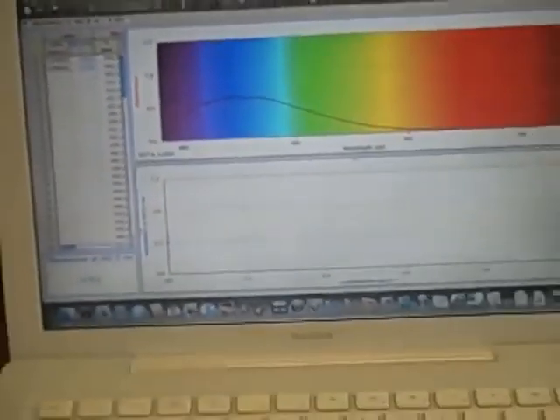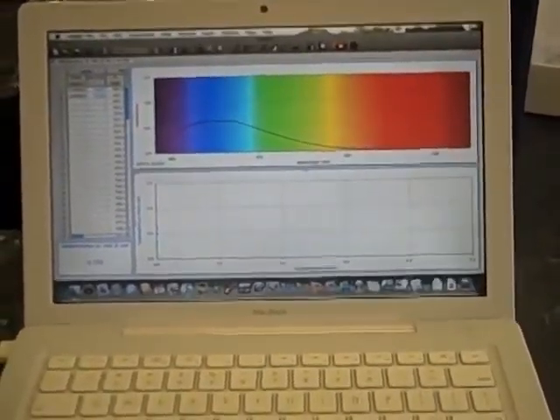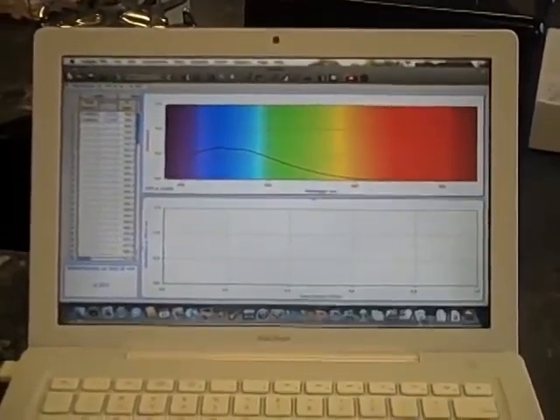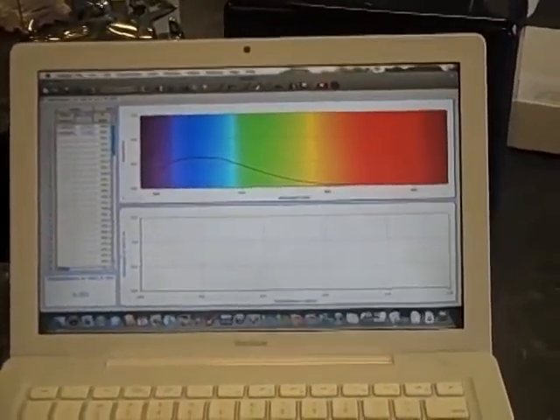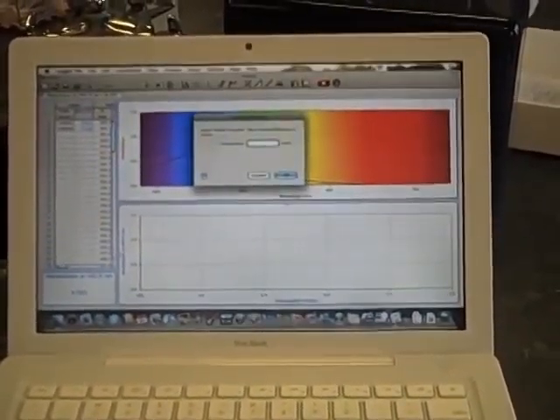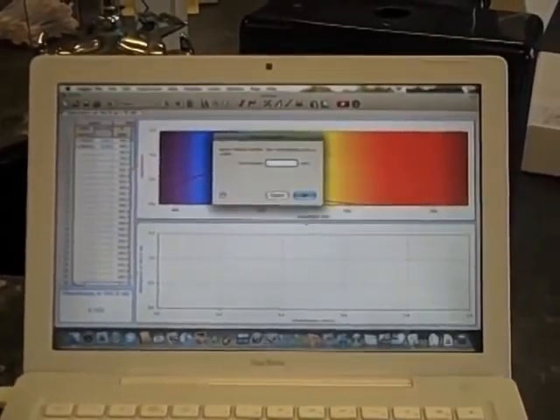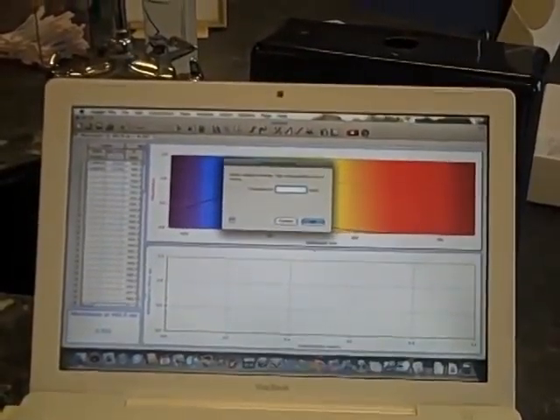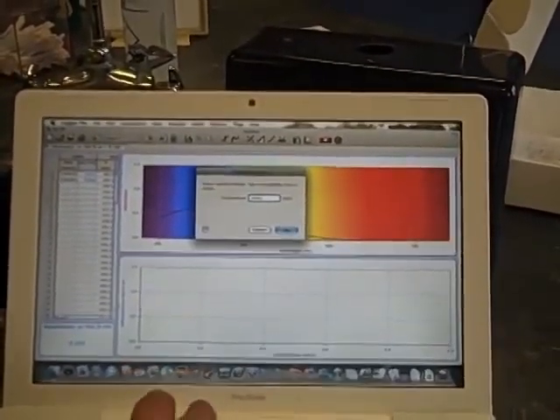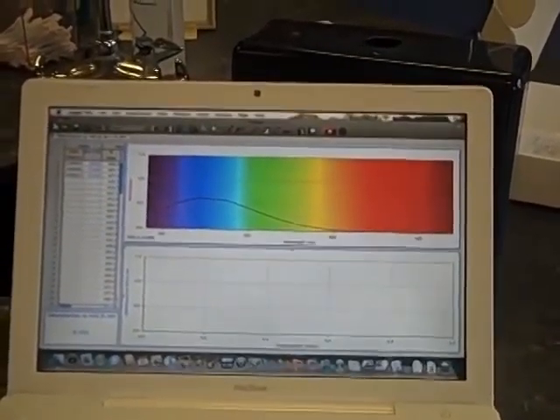Okay. So this one looks like it's still trying to stabilize, 0.353. It's been there for a while. I think that's good. Okay, sounds good. All right, keeping that one. Don't forget to hit keep. Good. And then we're going to put in the concentration for that one, which is 0.00012. Okay, 0.00012, and that's from the pre-lab exercise where we calculated these. Good.